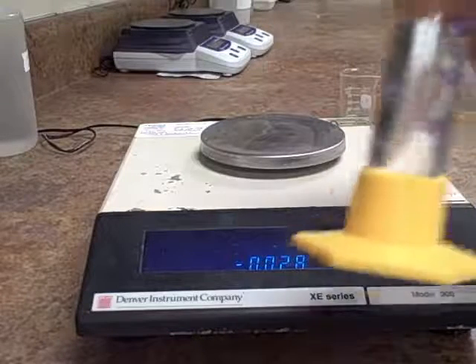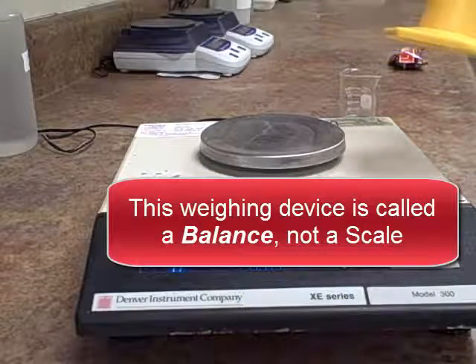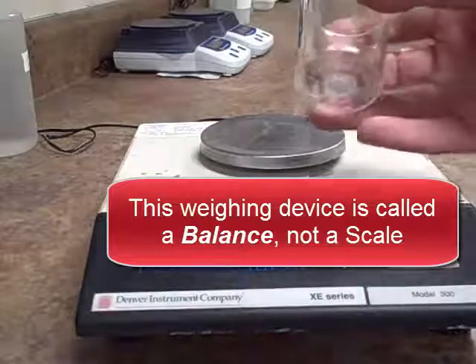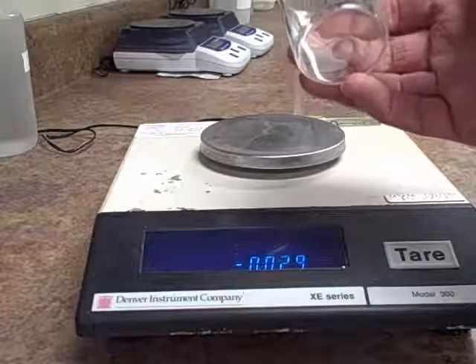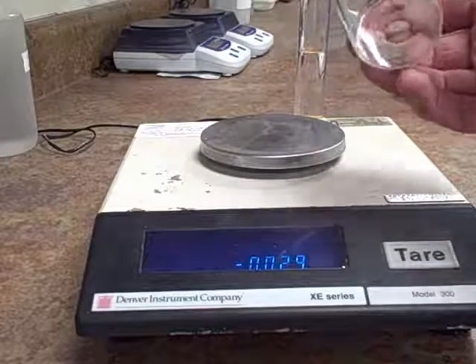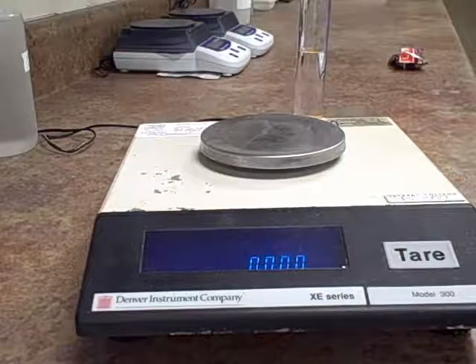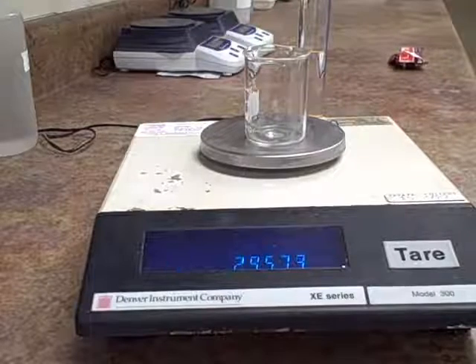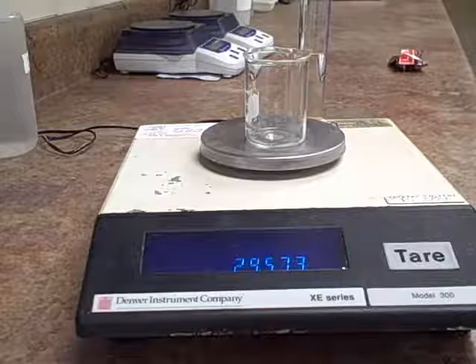Rather than directly weigh the graduated cylinder with the salt water on the balance, I'm going to use this small beaker as a container for the salt water and weigh the beaker and the salt water. But first I'm going to tare the balance, clear it, and then weigh the weight of the beaker. Now I could tare the weight of the beaker, clear it out, and add the salt water.